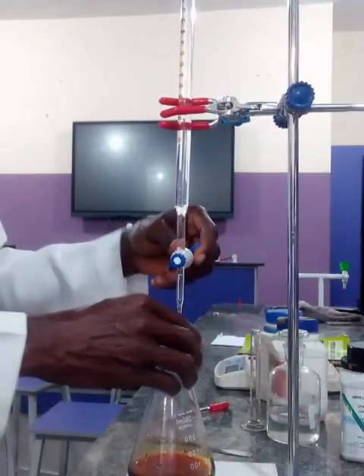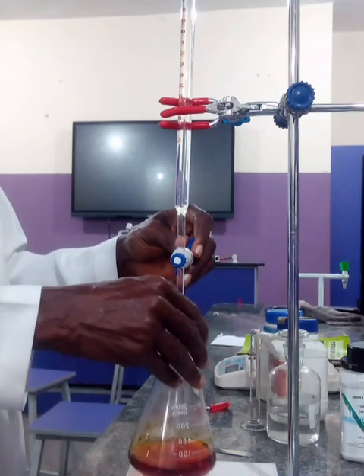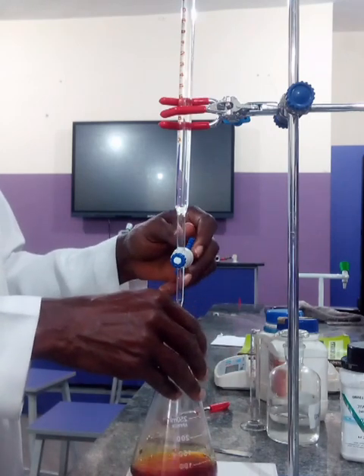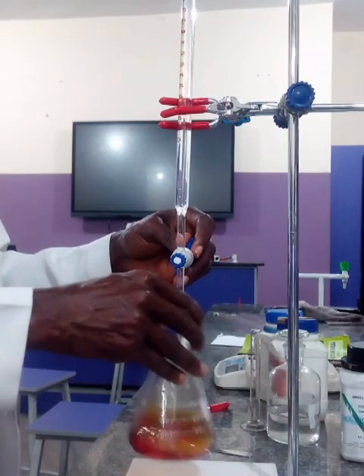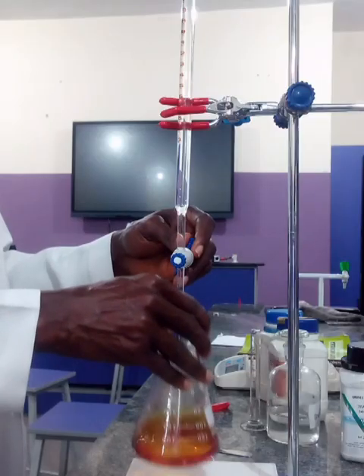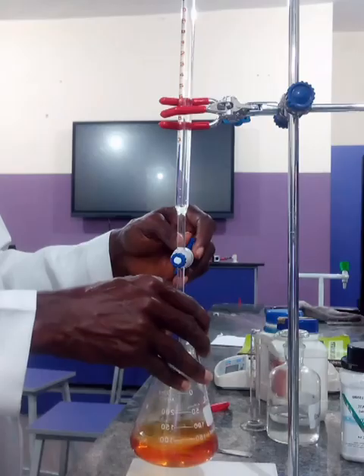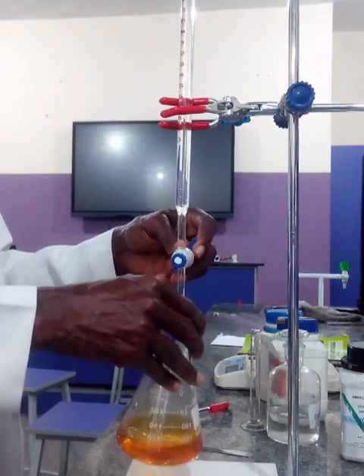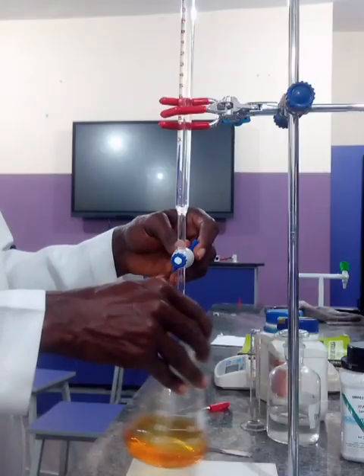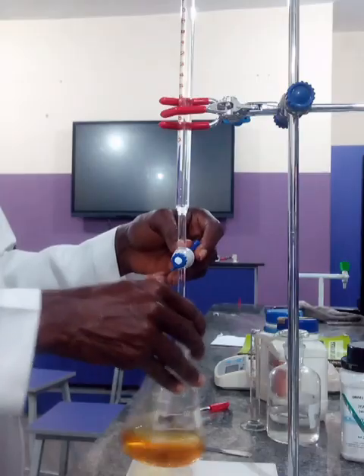Now, before you do this titration, you need also to prepare a standard hydrochloric acid solution of 2 moles per dm cube, and you should also have potassium iodide ready.